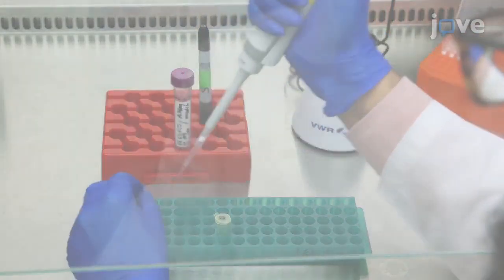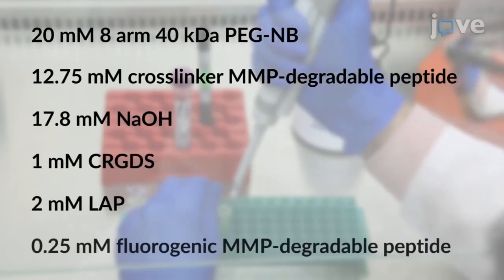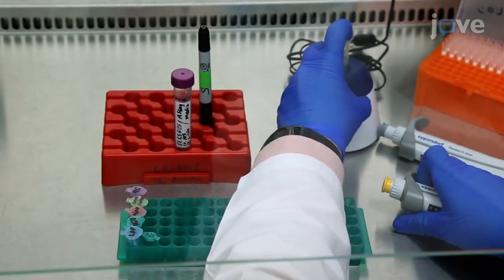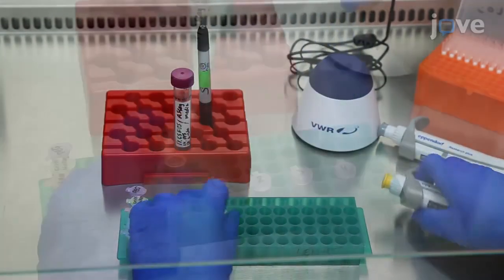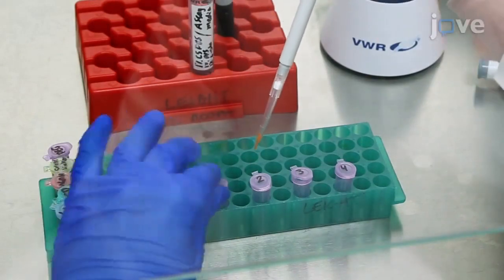Next, prepare the hydrogel precursor solution by adding the reagents to a 1.5 milliliter tube. Make sure to vortex after addition of each component. Then divide the solution into multiple 1.5 milliliter tubes for different conditions.